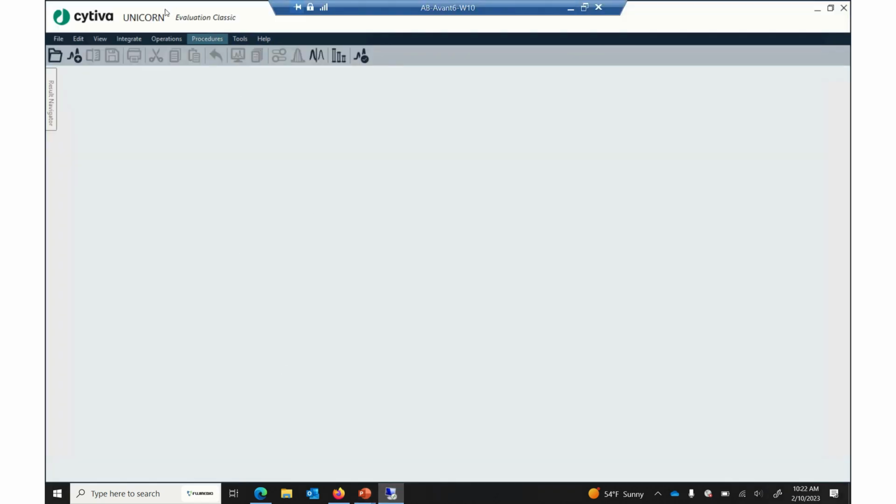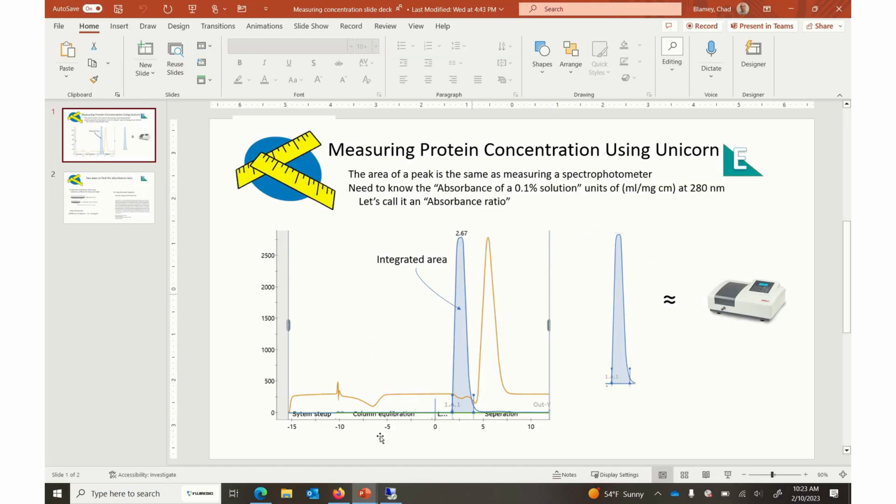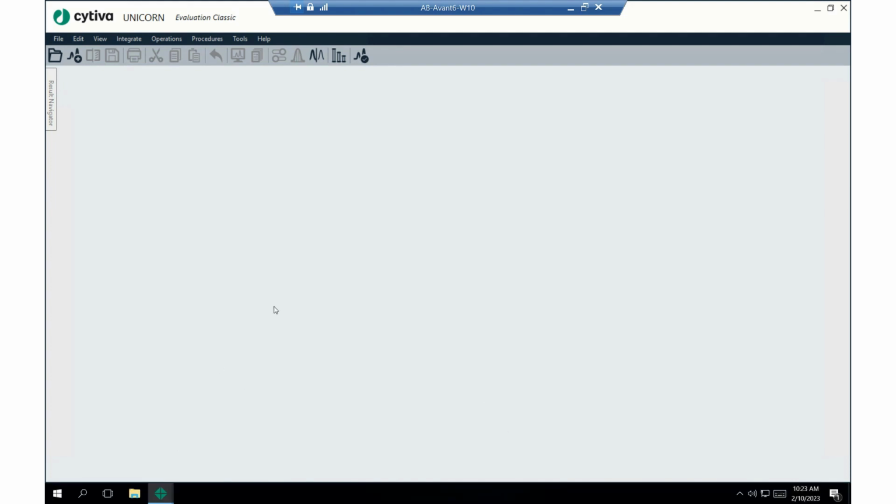Alright, so here we are in the Evaluation Classic module. There, okay. So here we are in Unicorn, and we're still doing introductory videos.